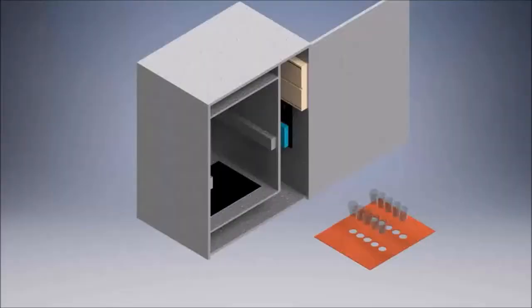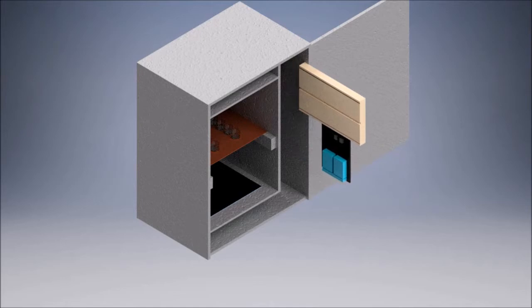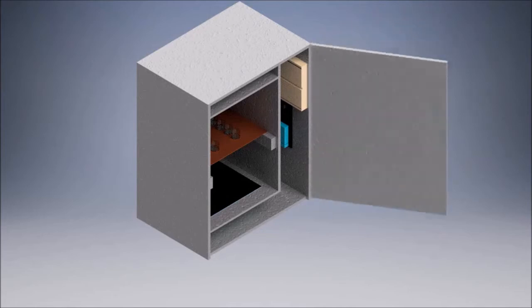Inside of the box is a copper plate in which holes are drilled into it in order to place ELISA cups. On the bottom of the copper plate, a heating element is attached that is controlled to 37 degrees Celsius by the microcontroller. On the copper plate, we can also store capillaries. On the top of the box, there is the camera that will take pictures for color analysis of the ELISA cups. On the right side, we have all the circuitry components that are required in order to run the microcontroller. And of course, a door.